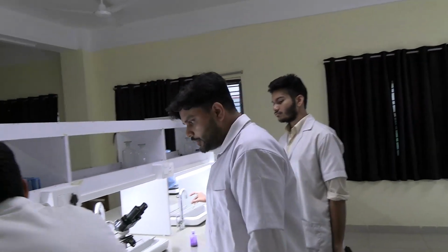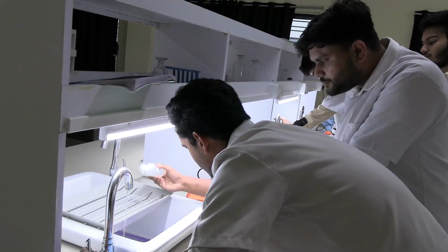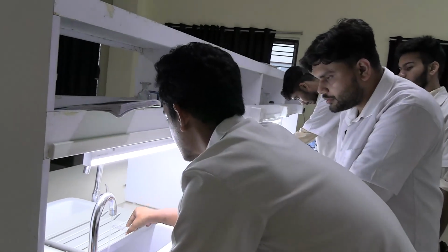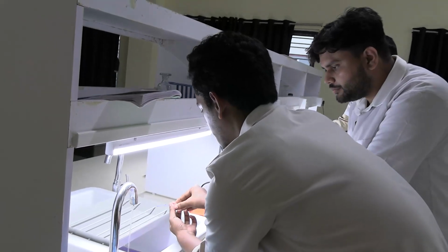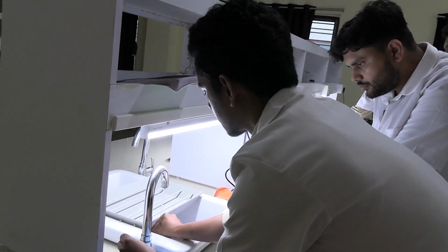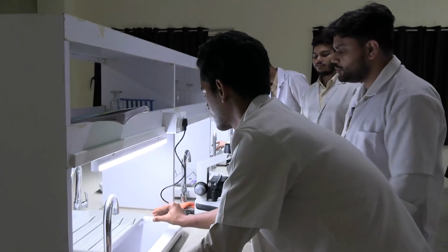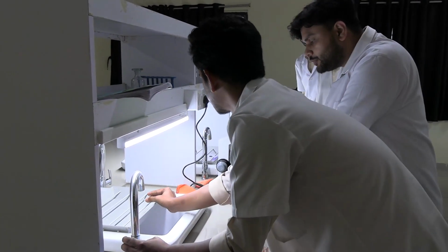Okay. You're gonna pour the decolorizer. Bas. You can wash directly using the same technique. Okay. Okay. I think that's enough. Now we're gonna do the counterstaining using safranin for 30 seconds. Okay. Do it.